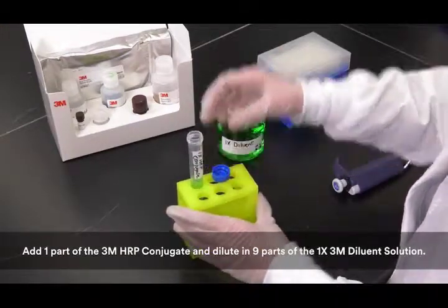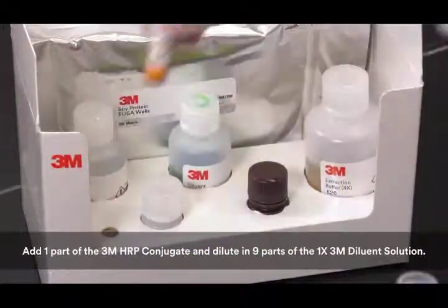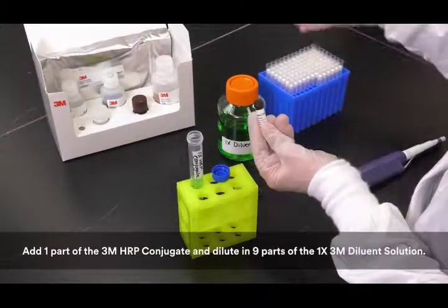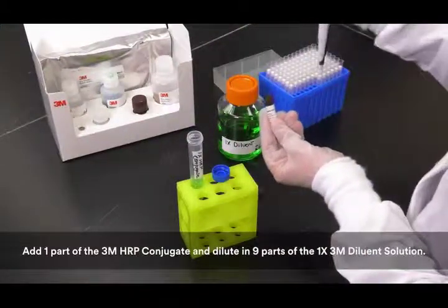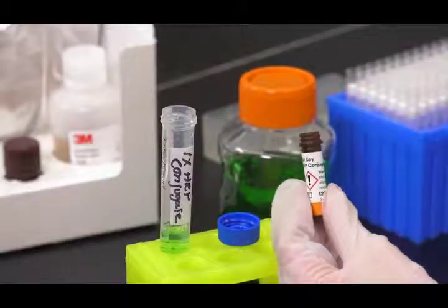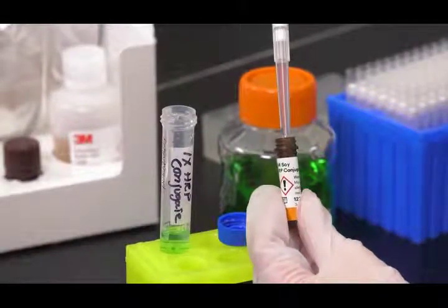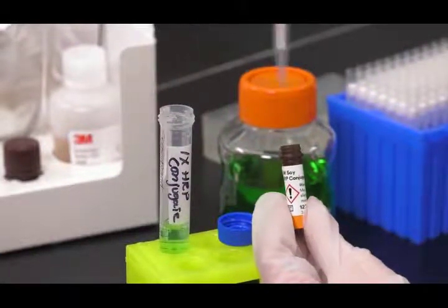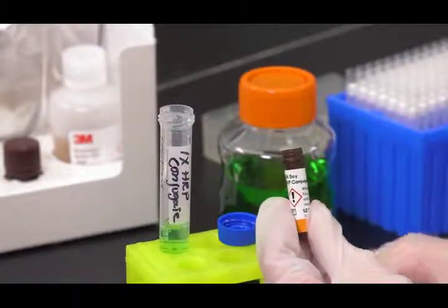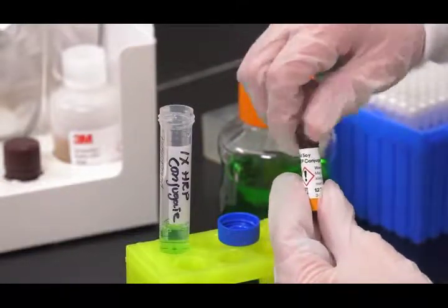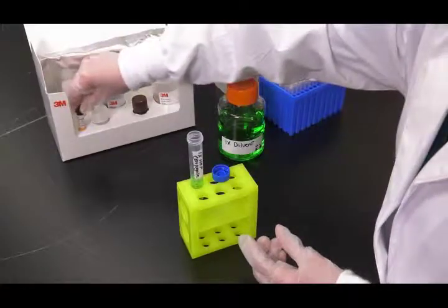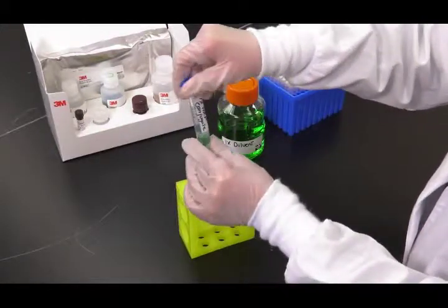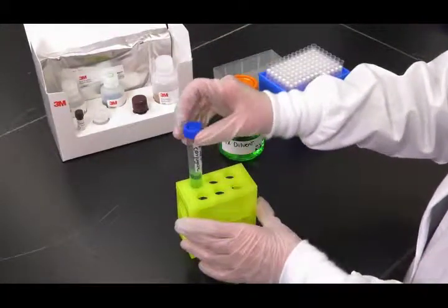To prepare the 3M allergen protein HRP conjugate, add one part of the conjugate and dilute in nine parts of the 1X diluent solution. Prepare immediately before use and do not store. Each 3M ELISA well requires 100 microliters of this 1X working conjugate.